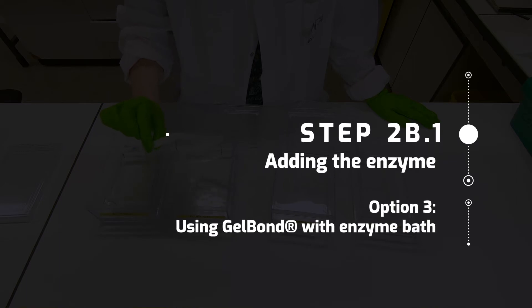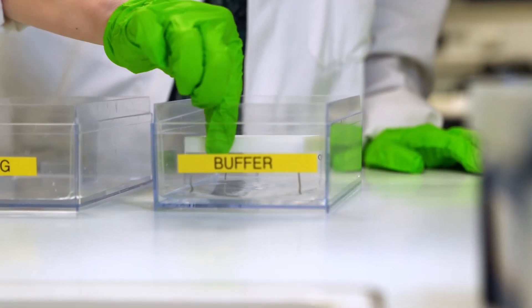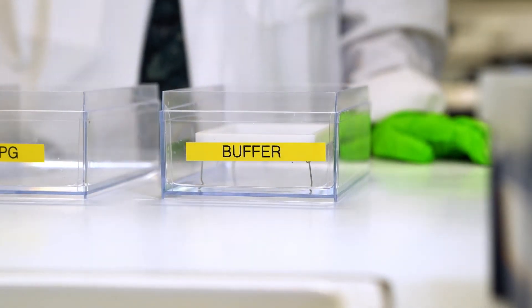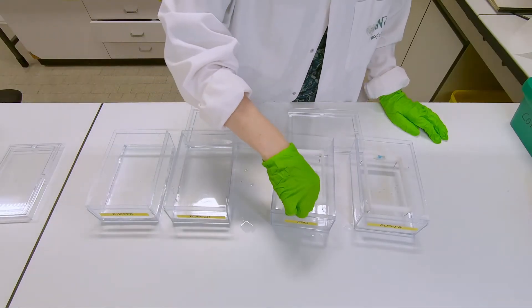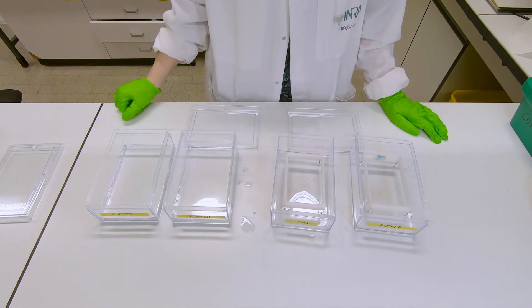For the enzyme incubation when using gels in gel bomb films, they are immersed in a bath with either enzyme reaction buffer or enzyme after washing them in cold reaction buffer.